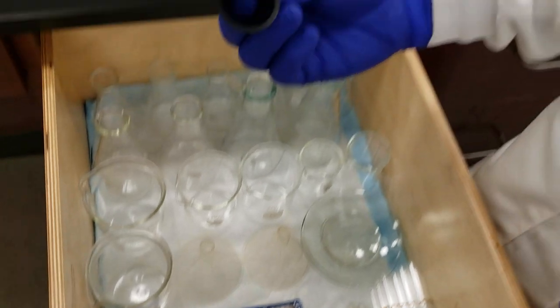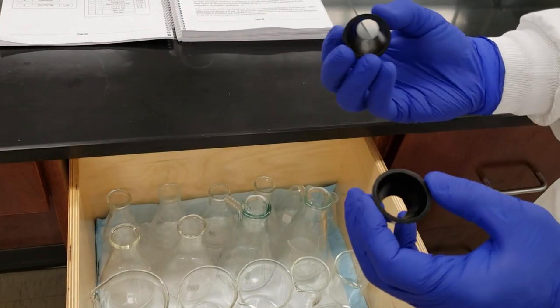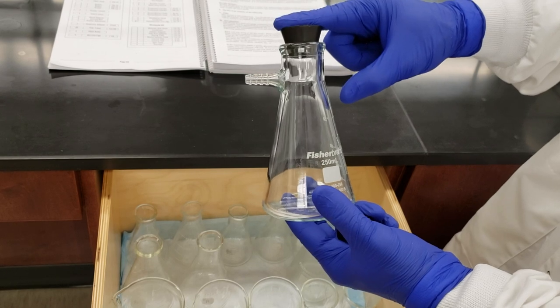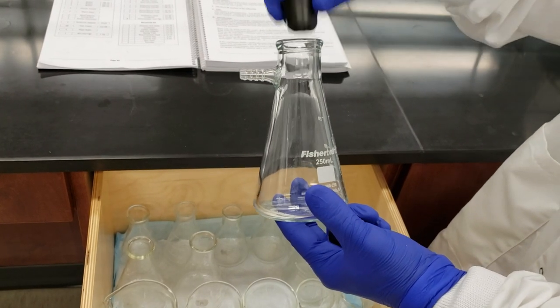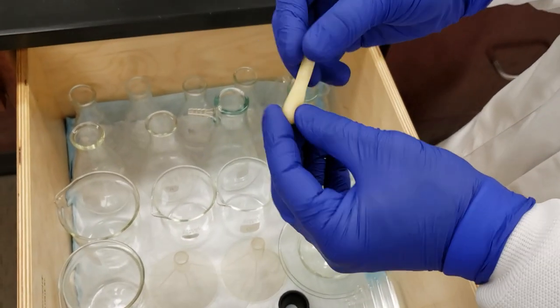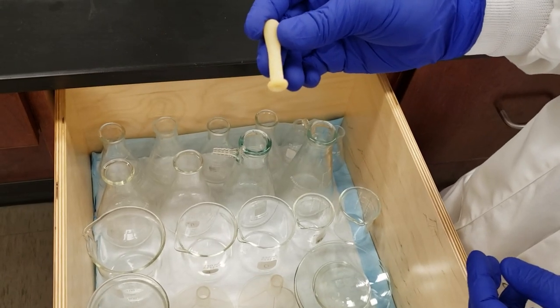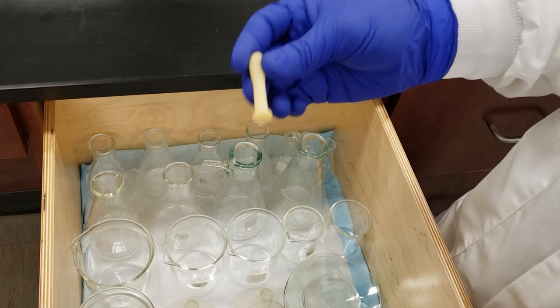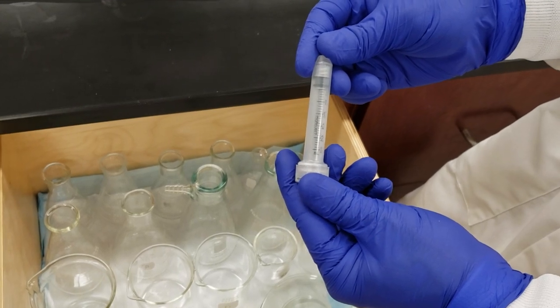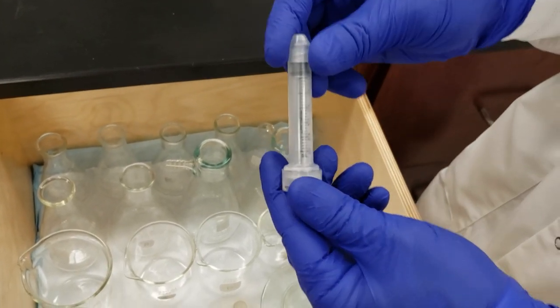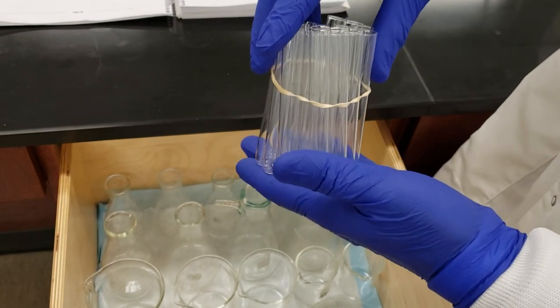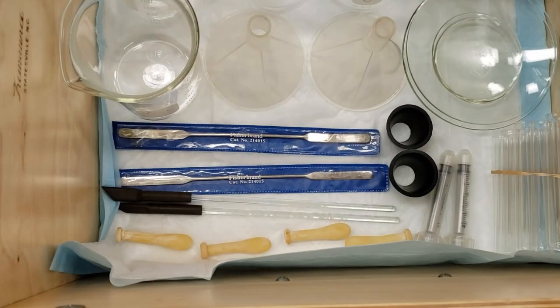Next are neoprene adapters to make a seal with our Erlenmeyer flask during suction filtration. We have rubber pipette bulbs that pair with glass pipettes to draw up liquids. We have two 3 mL syringes for doling out liquids during reactions, and a total of 20 test tubes neatly arranged with a rubber band. That's it for drawer number one.